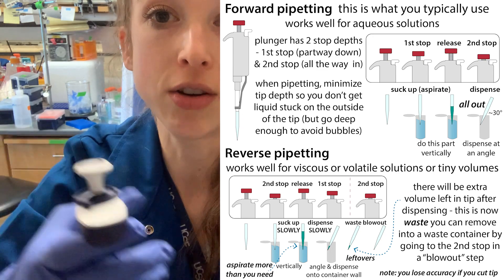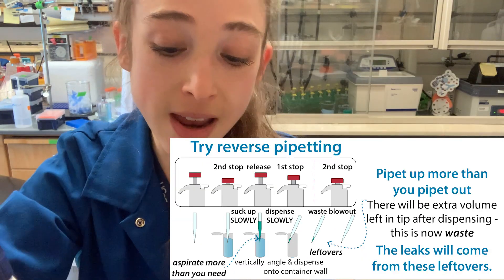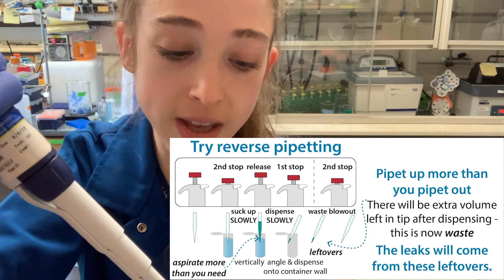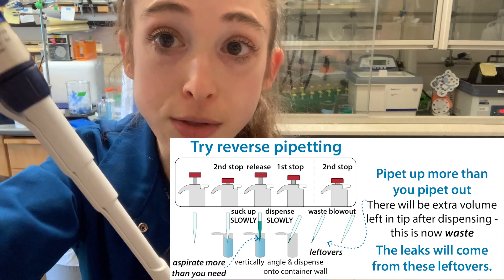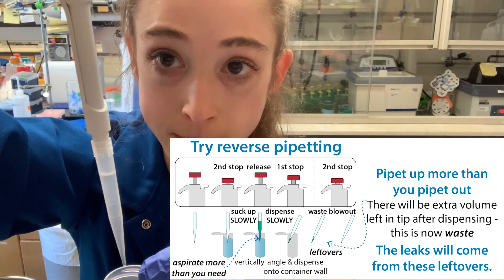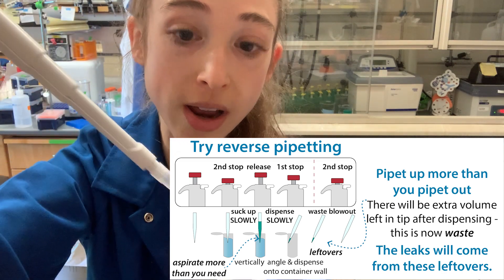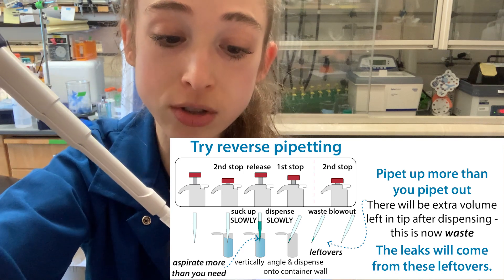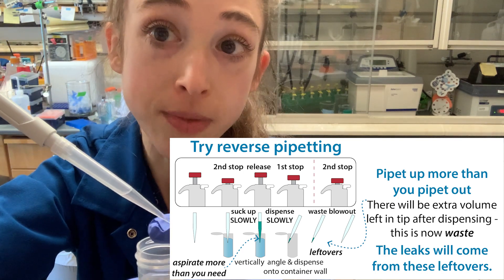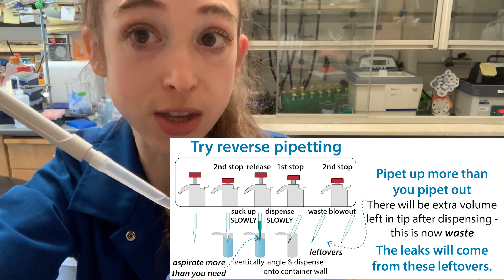With reverse pipetting, you actually suck up or aspirate more than you're going to release. You start by going all the way to that full second stop, go in, and pull it up. Now there's more in your pipette than you need. You're still going to get some dripping, but that dripping is going to come from the extra volume that's left when you dispense. You only go to the first stop — not the second stop — and that extra volume in the tip is where the leaking was coming from, not from the actual volume you wanted to pipette.